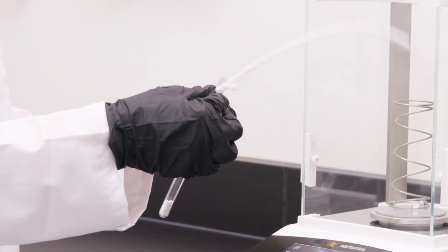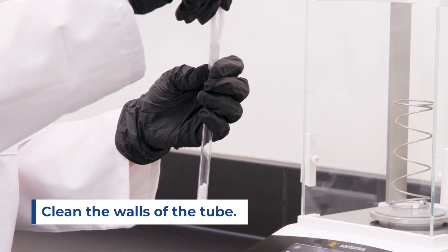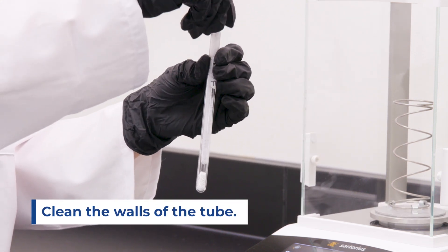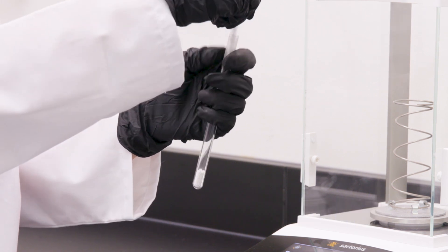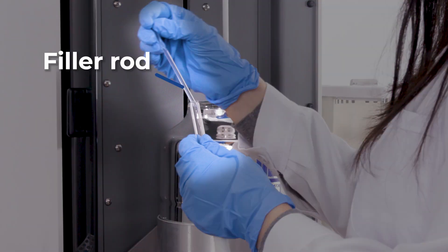Once the sample is transferred into the sample tube, ensure to clean the walls for an accurate result. This ensures the sample is properly kept within the heating zone during the degassing process, and also keeps the sample intact when using the filler rod.